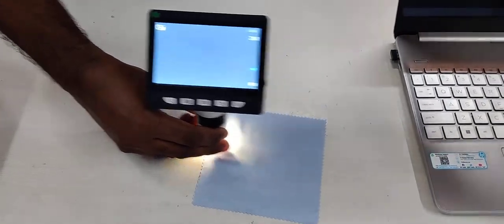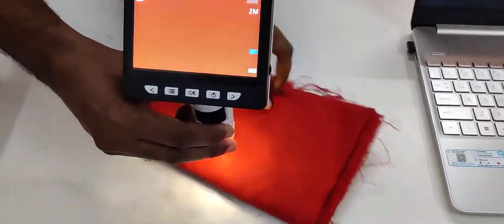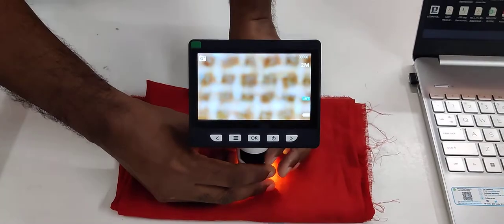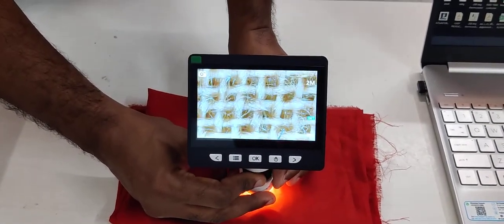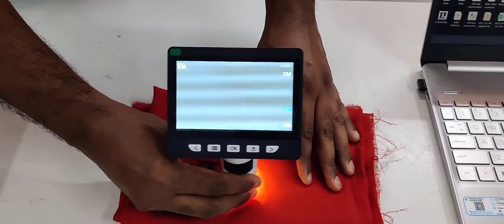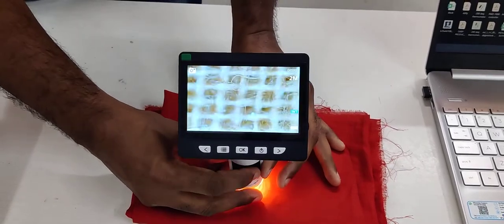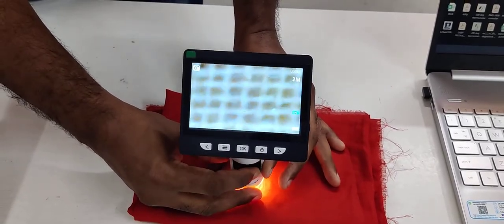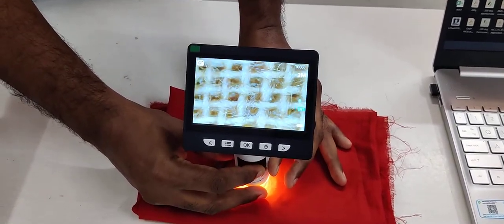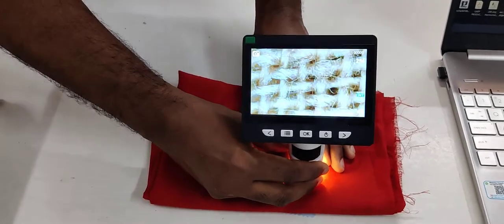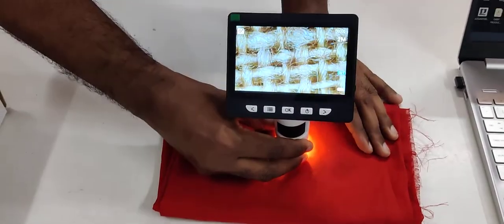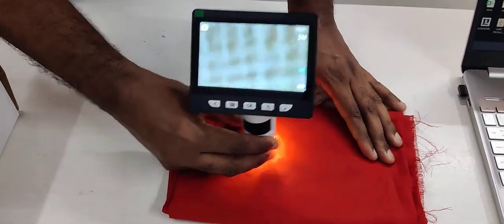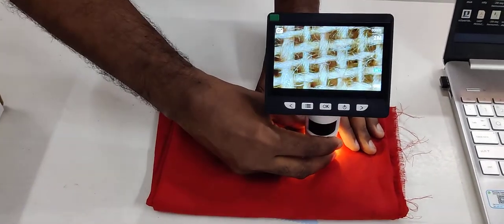I will show you another sample. Just you can move and just zoom it. You can check all damages, whatever the things.